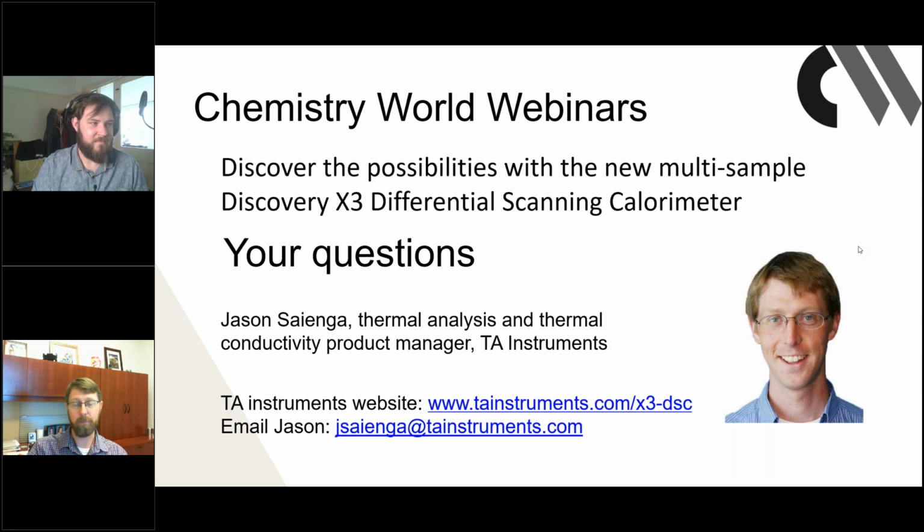There are no extra steps except for the fact that you have 3 samples that you have to weigh out. So you're making indium measurements on all 3 samples, so you need to have an indium on each sample platform. If you're familiar with the Tzero sapphires, you'll have more sapphires, but you'll have the same number of experiments to accomplish your calibration, the same number that you would have on the older generation.